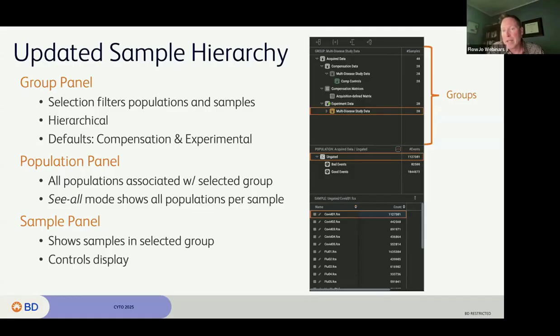So that's new, that it actually separates out and goes to the comp data group, and that the comp data group will have subfolders for every experiment you drag in, assuming that we can find comp controls for those experiments. So if you have things that are annotated with the word comp and divided up into folders by experiment, you should just be able to select a single folder and hit go and run compensation or unmixing for that given experiment, even if you've loaded many different experiments into a workspace. So I hope you find that like a nice improvement.